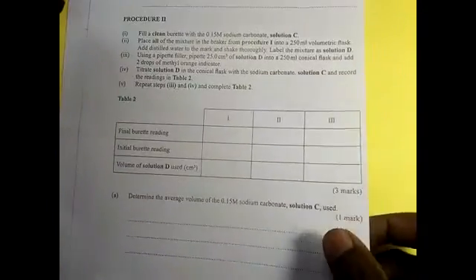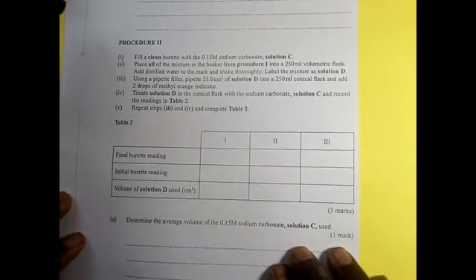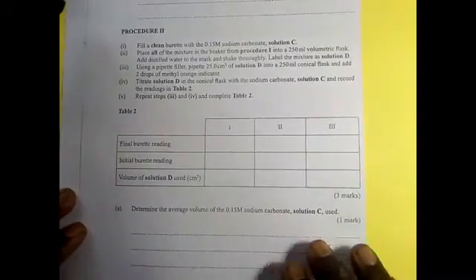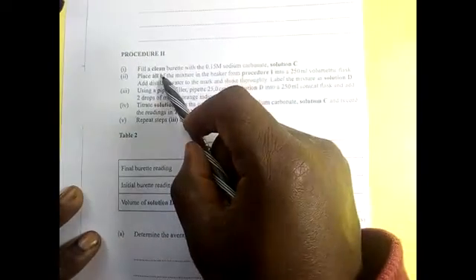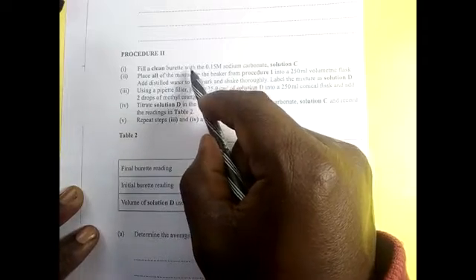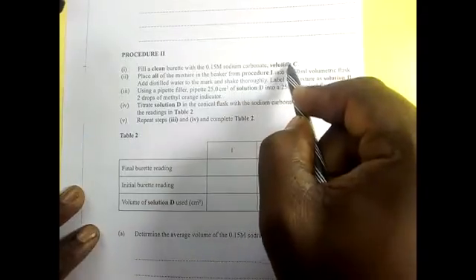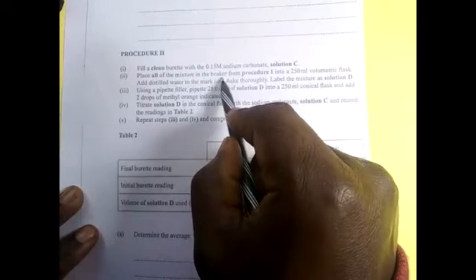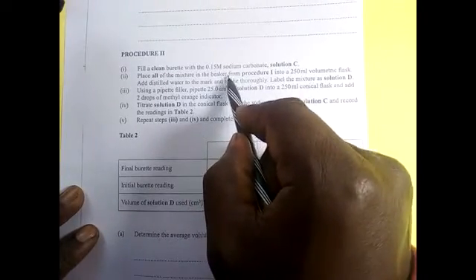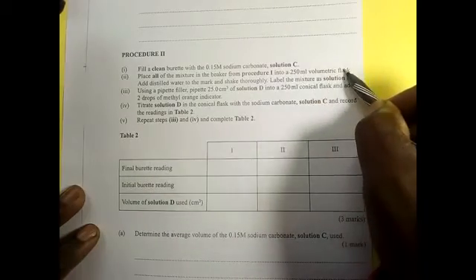So let us go direct to titration, and then we shall see. This is our titration paper. So let us read the procedure. Fill a clean burette with the 0.15 molar sodium carbonate, solution C. Place all of the mixture in the beaker from procedure 1 into a 250 ml volumetric flask.